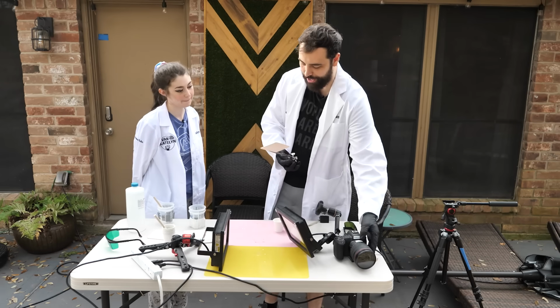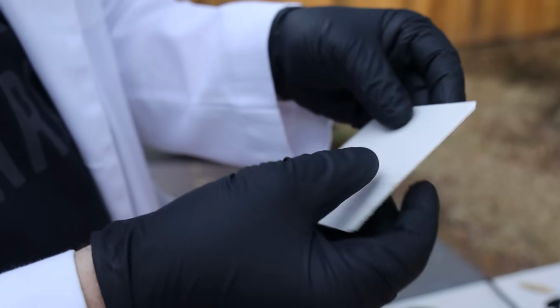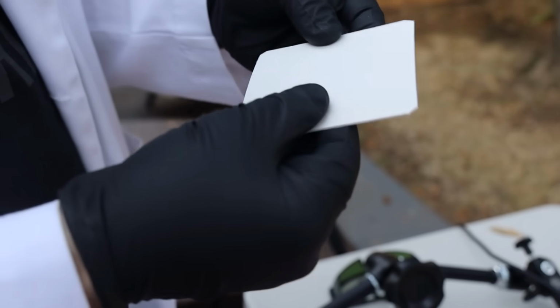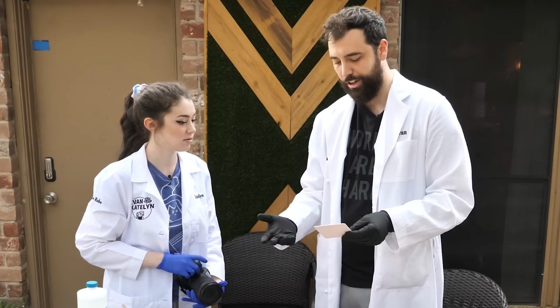Another thing I want to do, let's see, how durable is this? After the bleaching process, is it going to break? It's looking pretty good so far. It seems like similar durability because we just removed the color from the lignin. We didn't dissolve the lignin. The lignin's still there. It's just colorless. So structurally, it's still good.